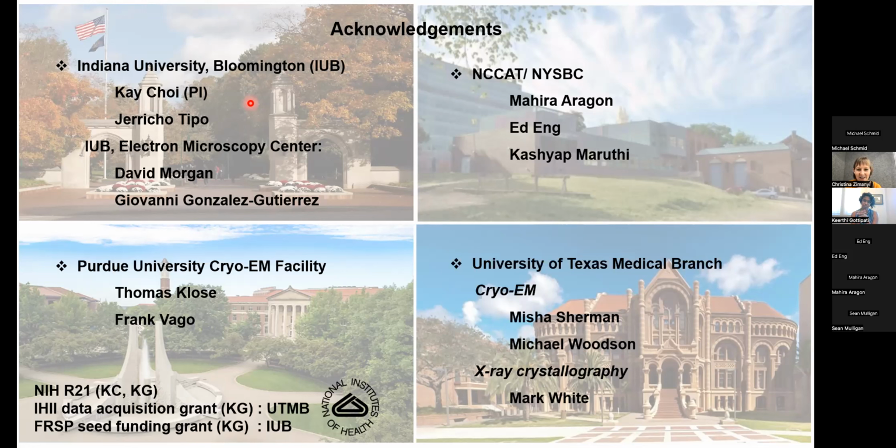Thank you. There's a question from Kai. He said a lot of the classes that were excluded from ab initio look like plausible RNA structures. Did you further investigate those via refinement? We did some of them, but there are not enough particles corresponding to those classes to come up with any usable solutions for us.